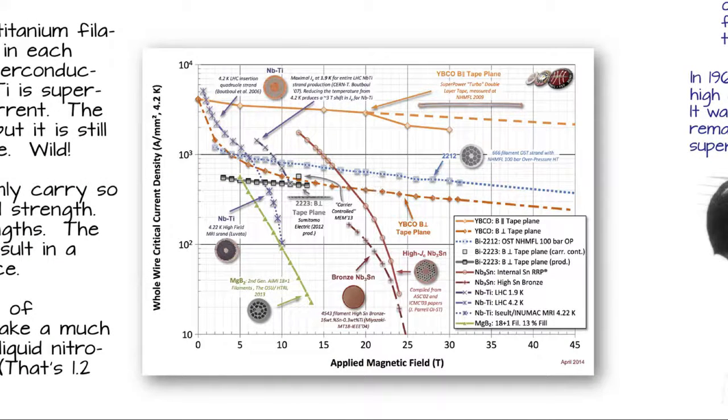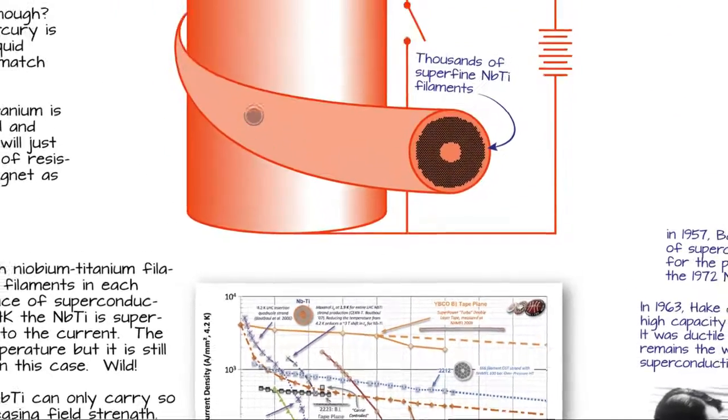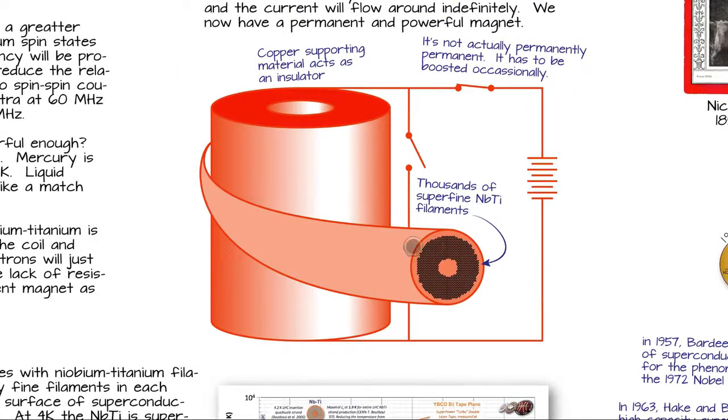And if you're designing a superconducting magnet today, you might use one of these ceramic materials. You can make a tape out of it, or you might use a wire. I'm going to discuss the wire construction that's in most superconducting magnets that I'm familiar with. You have a copper wire that is embedded with filaments of the niobium titanium alloy.